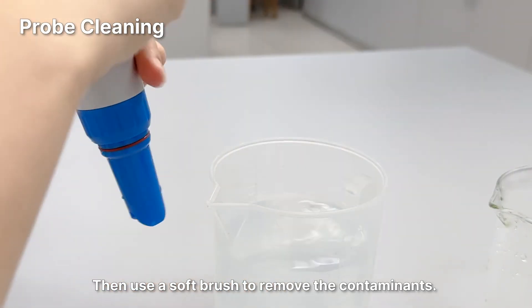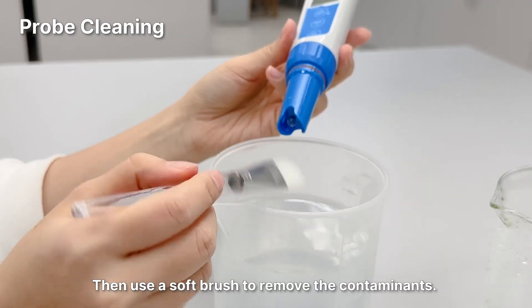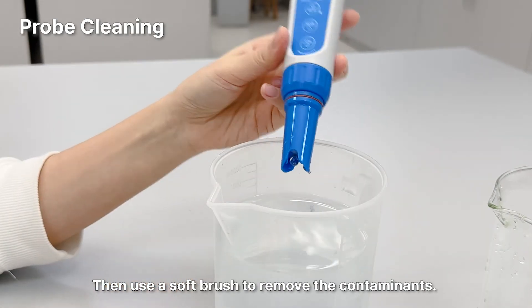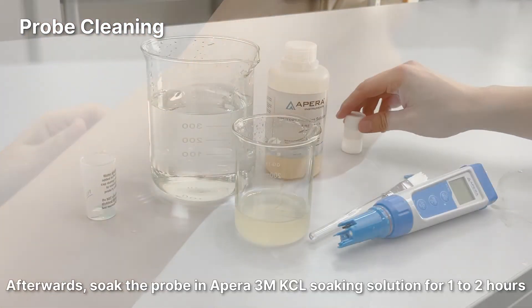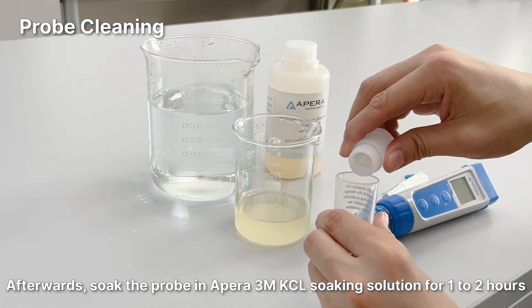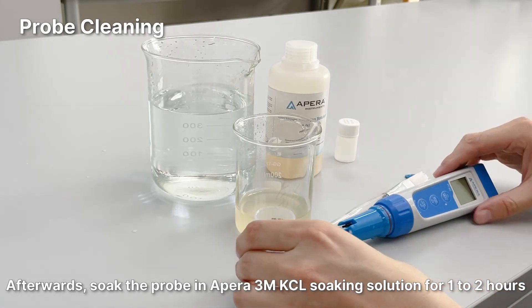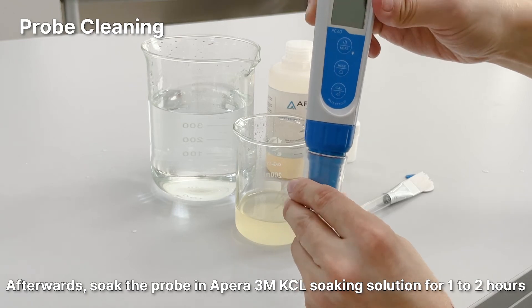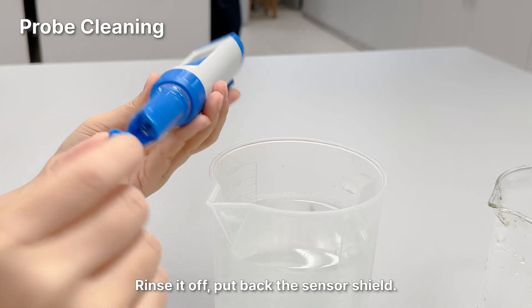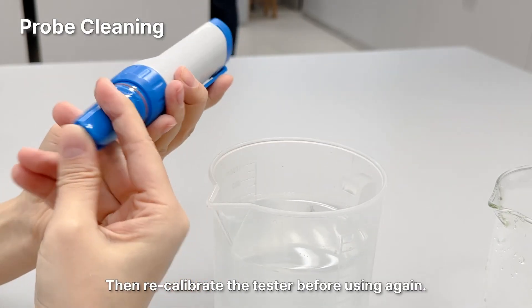Then use a soft brush to remove the contaminants. Afterwards, soak the probe in 3M KCl soaking solution for one to two hours. Rinse it off, put back the sensor shield, then recalibrate the tester before using again.